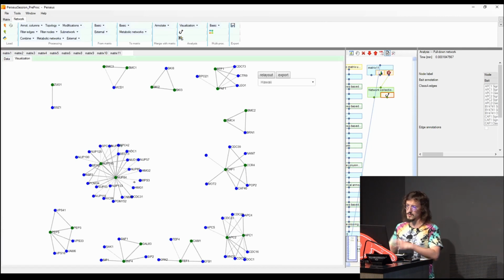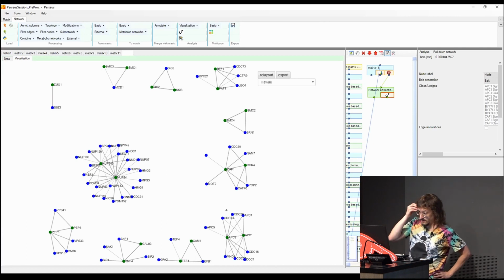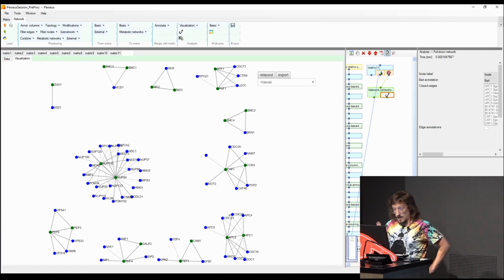And if you have time, you can go through every node and see that it is exactly one coming from that specific binder. This was only to show you which of the nodes are selected to create the network. Sorry, for the significant ones, so they are all these specific binders.